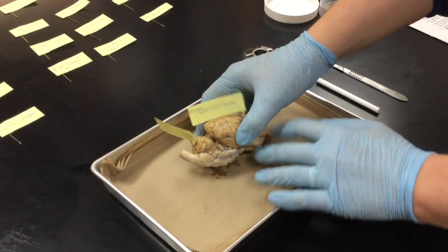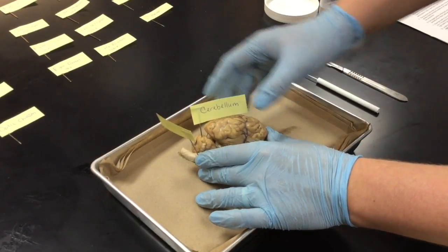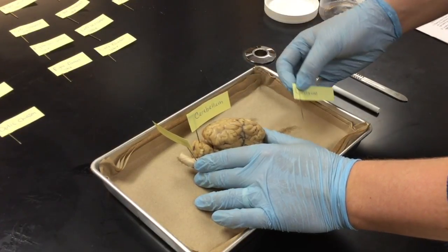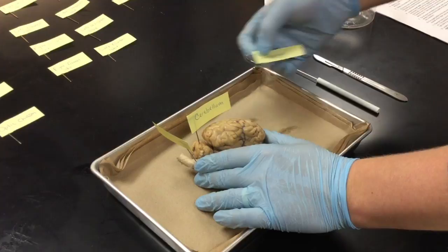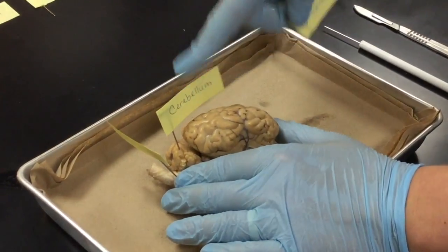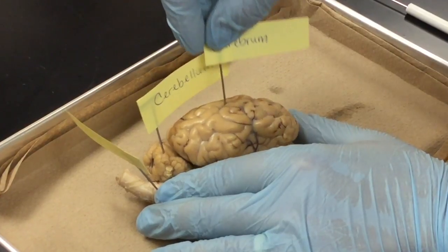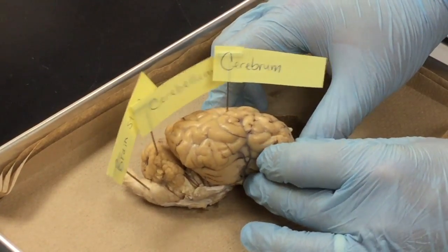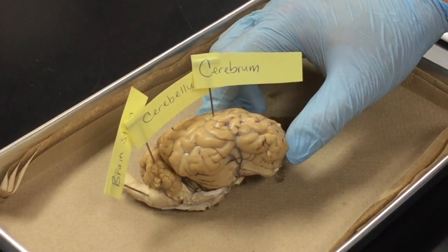Now the next and last region of the brain that we're going to have, of the three main regions, is called the cerebrum. The cerebrum is going to include all of the major lobes that we're going to look at in more detail. So the cerebrum is going to be this main portion that we see at the very top. So those are the three main regions that we have within the brain, three main parts.